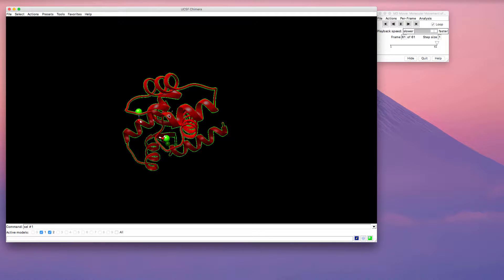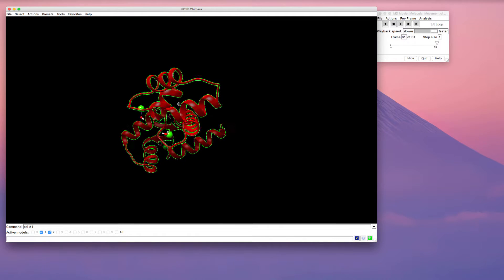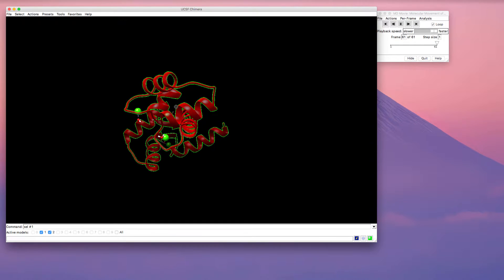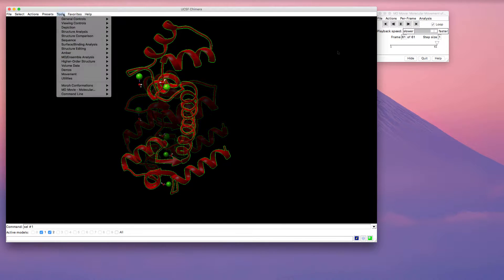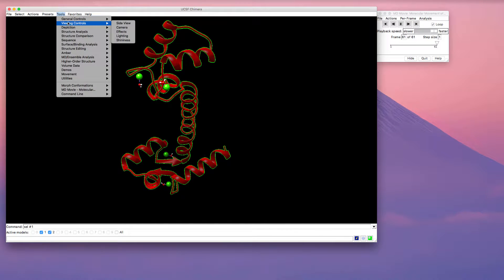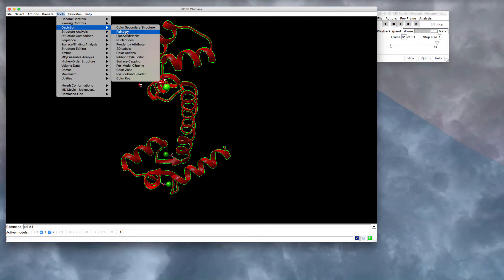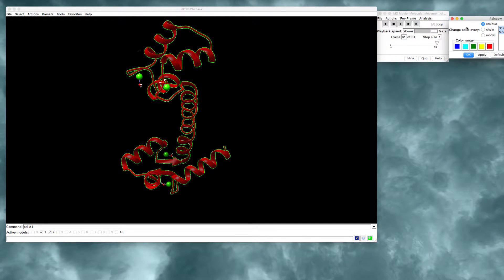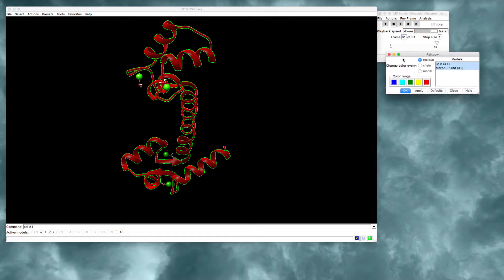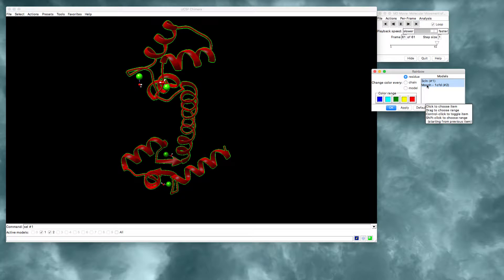Sometimes it's also nice to use the coloring tools. So if we go into the tools menu and go to depiction, there's a rainbow option. And that rainbow option allows you to choose the color range. If you just use the default color range, do this only to the morph and apply that. You get a nice rainbow.